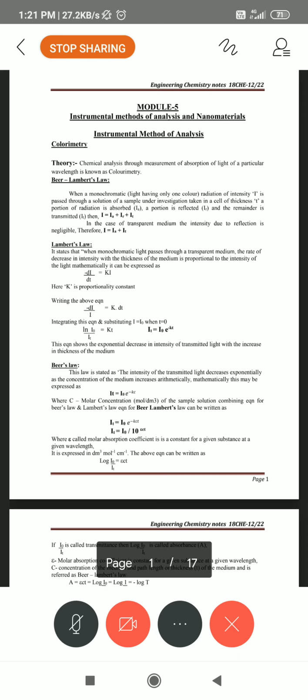This is used to fix the wavelength at 570 nanometers and to read the absorbance at 570 nanometers. You use it to calibrate the instrument. Afterwards, you take this and set it to 0.